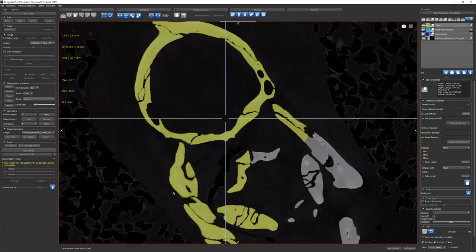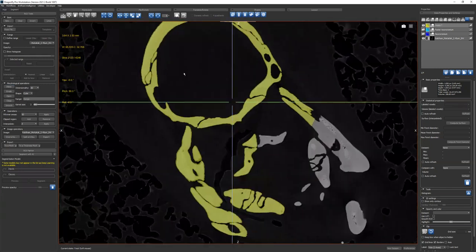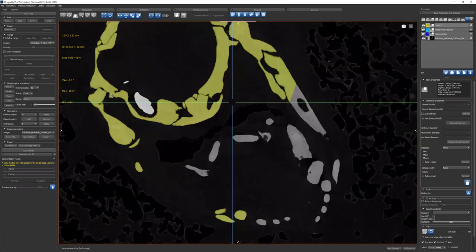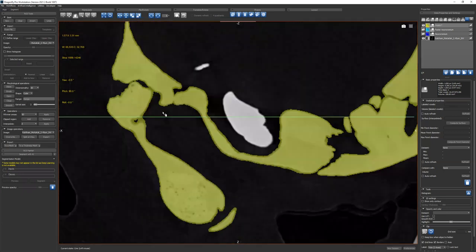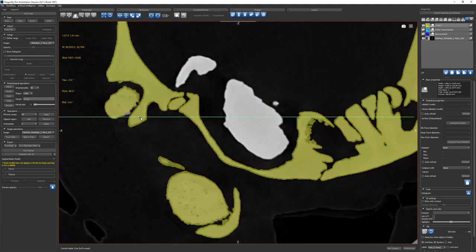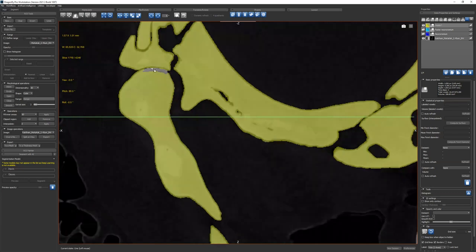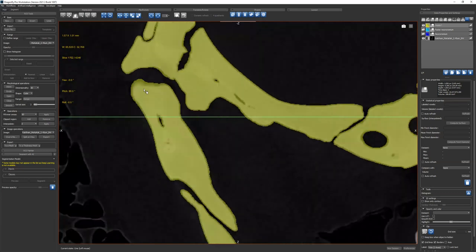Unfortunately, if we were really doing this, we'd have to go through and make sure we didn't make another connection with a bone. You probably will have made a connection with the hyomandibular. If you do that, which won't matter, it's not going to create this hyomandibular again, because this will be not selected, but it will have probably connected it to where there's a little bit of bone that belongs to the hyomandibular hanging on to the neurocranium, for example.